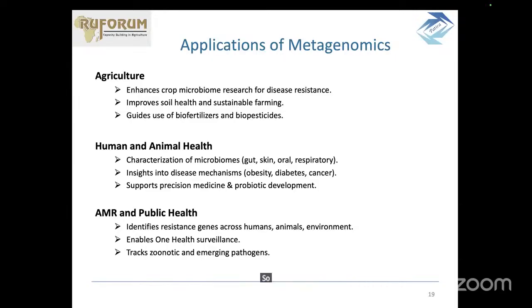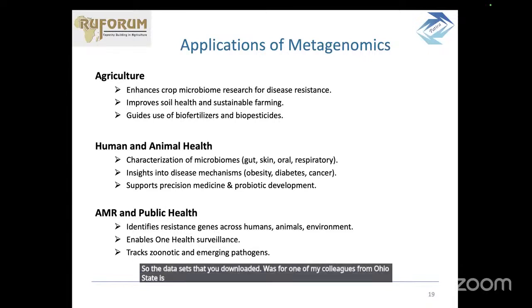The data sets that we are going to work on, I got from my colleague. She worked with biopesticides, by the way. The data sets that you downloaded were from one of my colleagues from Ohio State. It's from biopesticide. She works with biopesticide.